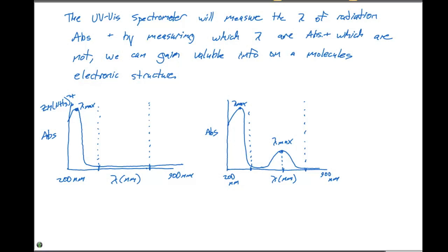Over here in the cobalt case, we're going to see an electronic excitation in the visible region of the spectrum. And just like I mentioned about the discrete energy levels and the runner going up the steps, notice that you see flat portions of this spectrum down here, and then you see a bump of absorbance, and then it goes flat again. This is also further evidence that in a molecule, you have these discrete energy levels that you're going to be exciting electrons to.